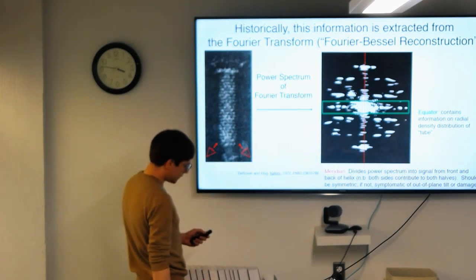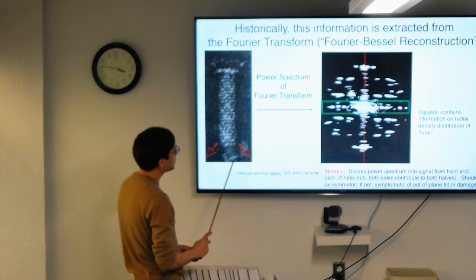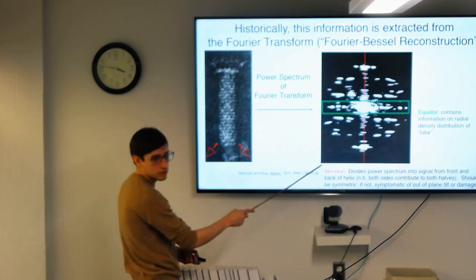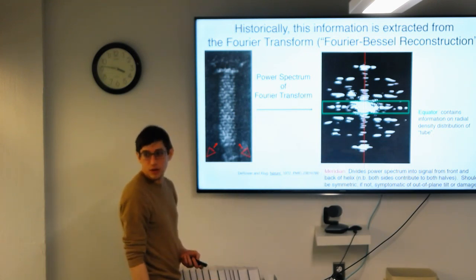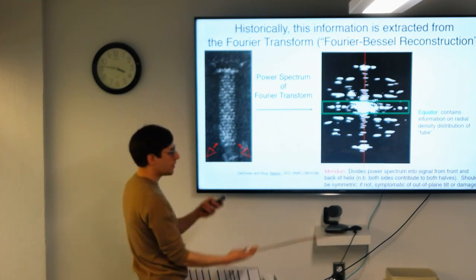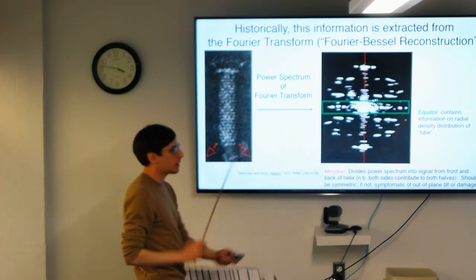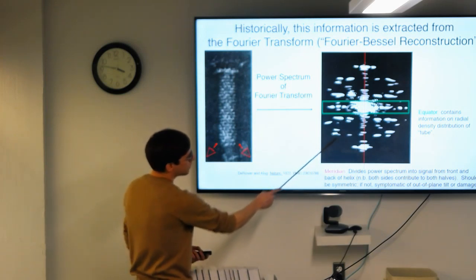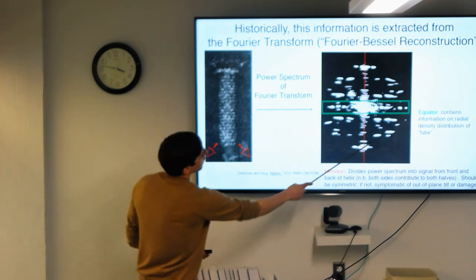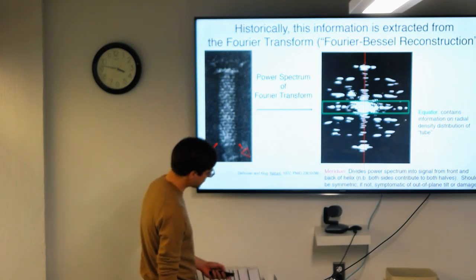If you don't understand that, it's not a huge deal for now. The one thing I'll just say is that whenever you start working on a helix, you always want to look at one of these diffraction patterns, and if it's not symmetric, that means there's something wrong with your sample. It means that either the back half of it is flattened or it's really badly tilted out of the axis of the image, and so it will be challenging to process. So you want to look for a helical specimen where the diffraction pattern is symmetric on the two sides to start with. Like how symmetric?